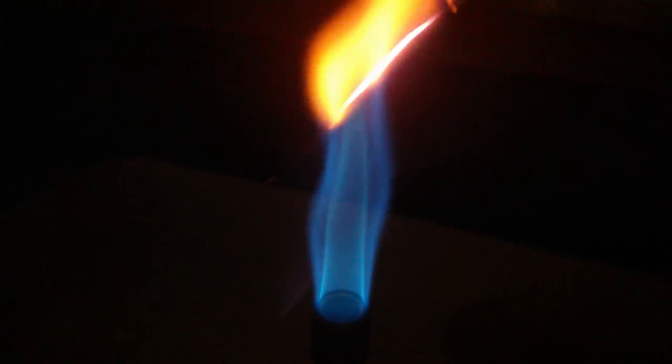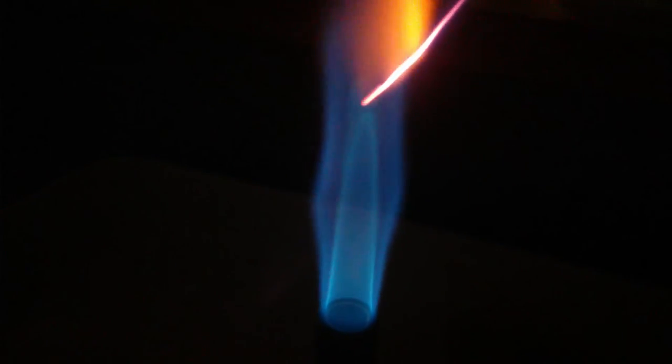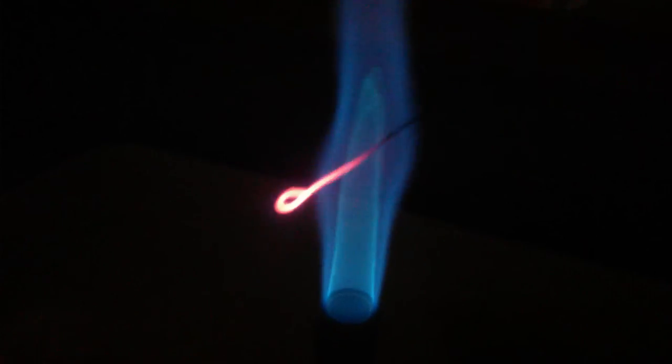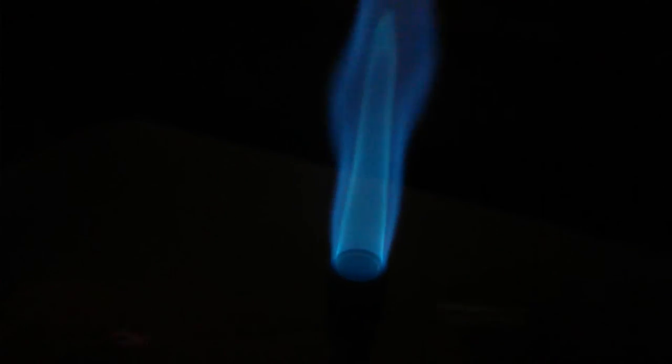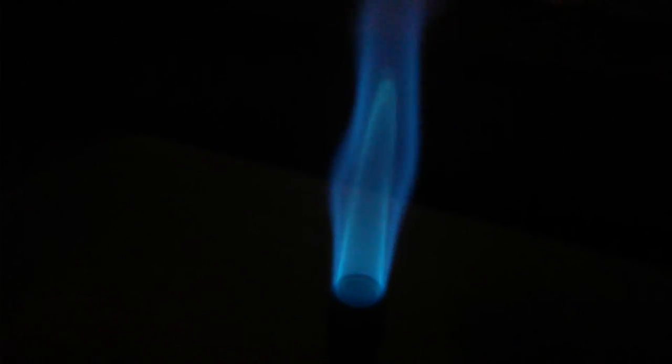If you place your loop inside at the tip of that flame, the small flame in the middle, it's going to become red hot very quickly and this is because this is the hottest point of the flame.